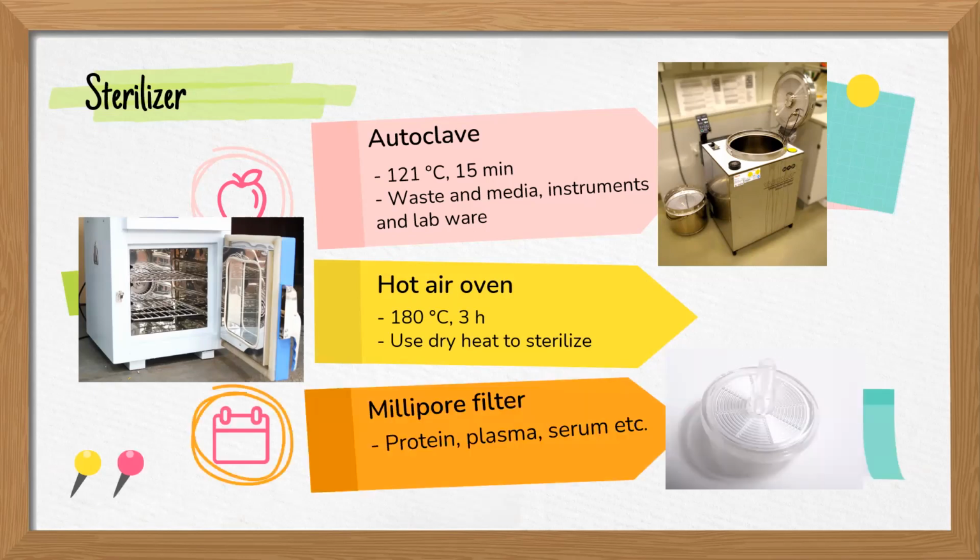Millipore filter. The filter's pore size is so small that bacteria cannot pass through it. Therefore, the filtered substance is free from bacteria and other organisms except viruses. It is used for thermosensitive substances such as protein, plasma, serum, or antibiotics.